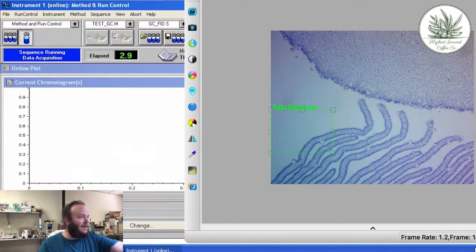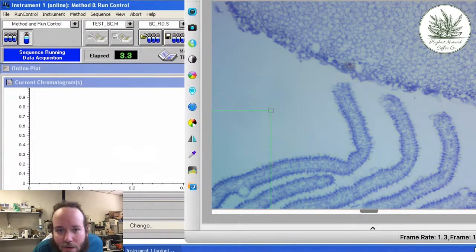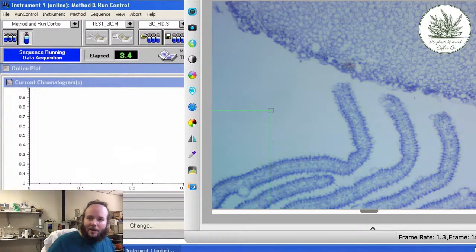All right, so what are we looking at? I don't even remember. I wasn't paying attention. I have a cheat sheet. Oh. All right, so this is mushroom. We're looking at mushroom cells. So let's go ahead and... That's kind of cool. You can already see some neat stuff in there. So I'm going to jack this up to 50.